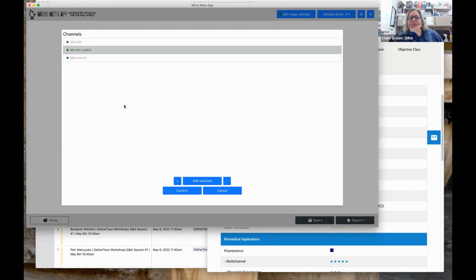I don't know if we need to address it now, but there were some questions just about having templates, so I reposted the link for the example Microscope.JSON files. But just the general comments of whether there could be a library of Zeiss objectives or a library of standard configurations of microscopes from the different companies. Yeah, so that's what we really want to do.